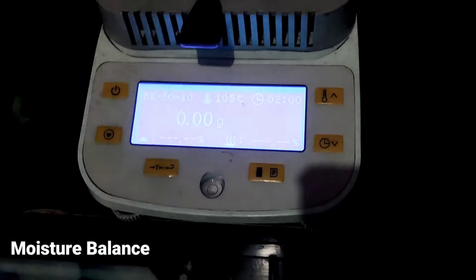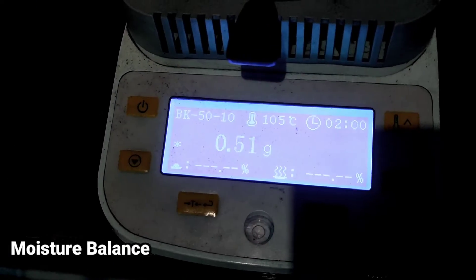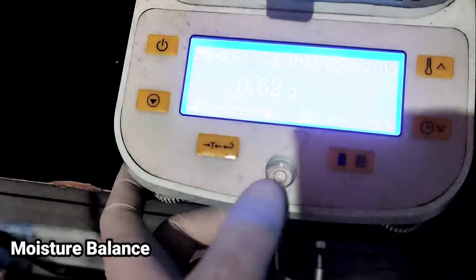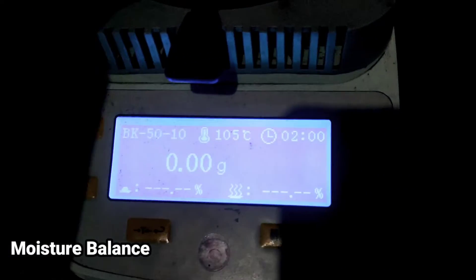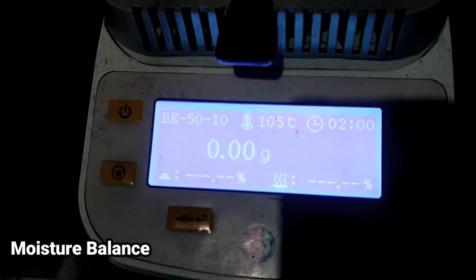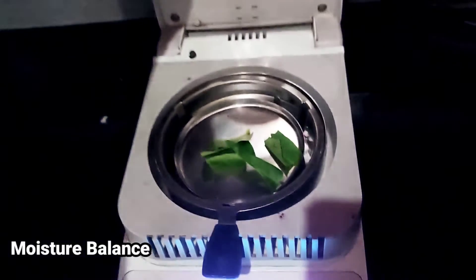Setelah itu, kita masukkan sample. Ini terukur 0,53 gram. Jika mau kalibrasi, kita back sampai 0 gram — kita ambil dulu, kita kalibrasi dulu. Balik, baru kita masukkan lagi. Setelah itu kita tutup.